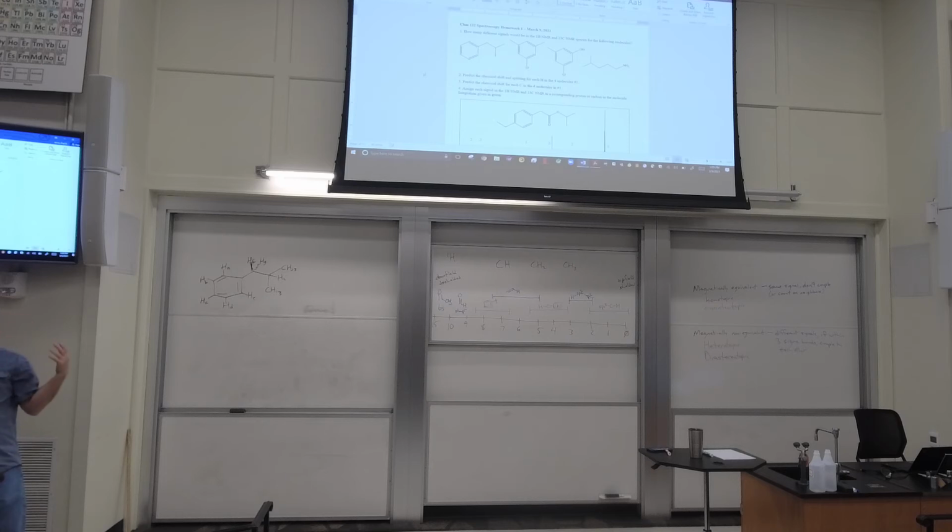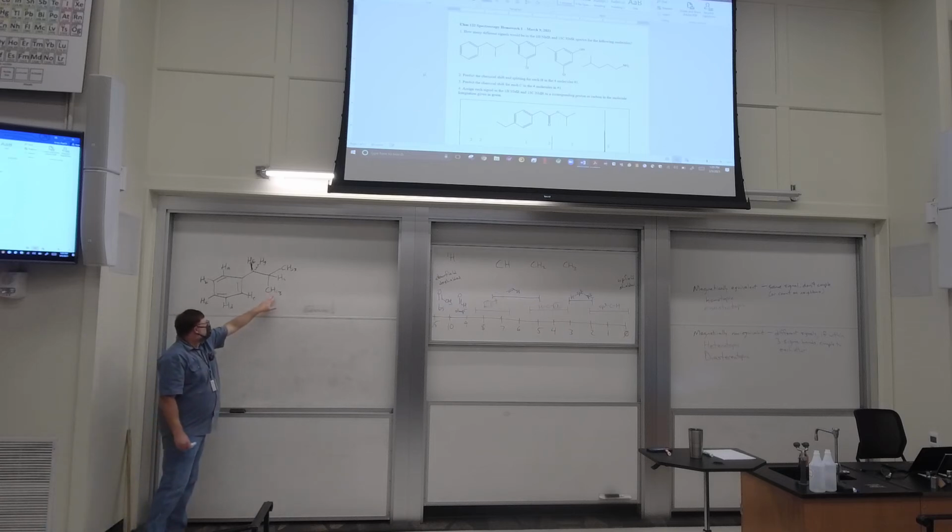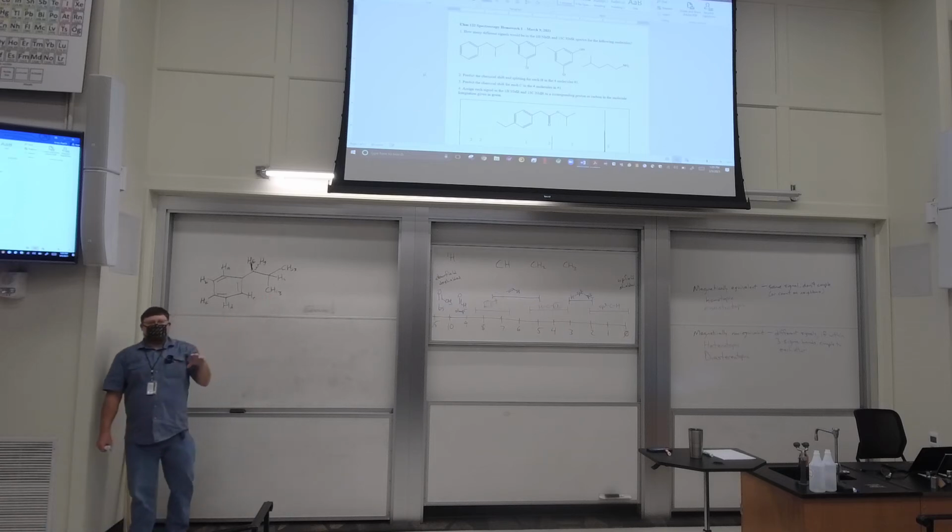If you didn't notice that from what we did at first, the less symmetrical a molecule is, the messier its spectrum is going to be. So if you have a chiral center in a molecule, all of a sudden almost every proton is different or magnetically non-equivalent. Methyls can be magnetically non-equivalent. But the 3 protons on a methyl will always be homotopic.